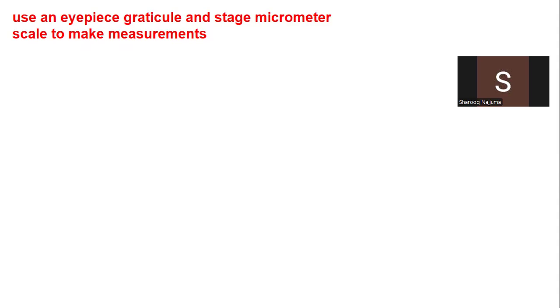I am here to take you through using an eyepiece graticule and stage micrometer to make measurements. This is a concept that is going to help you in your practicals and generally in your papers. You'll be expected to know how to use an eyepiece graticule to make measurements. So how is an eyepiece graticule used?